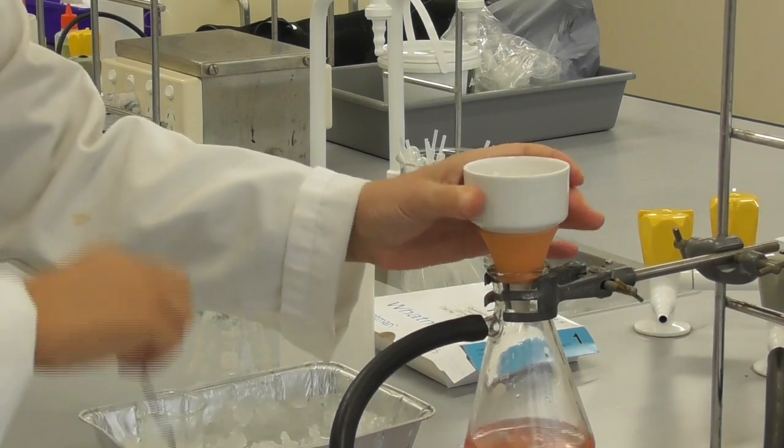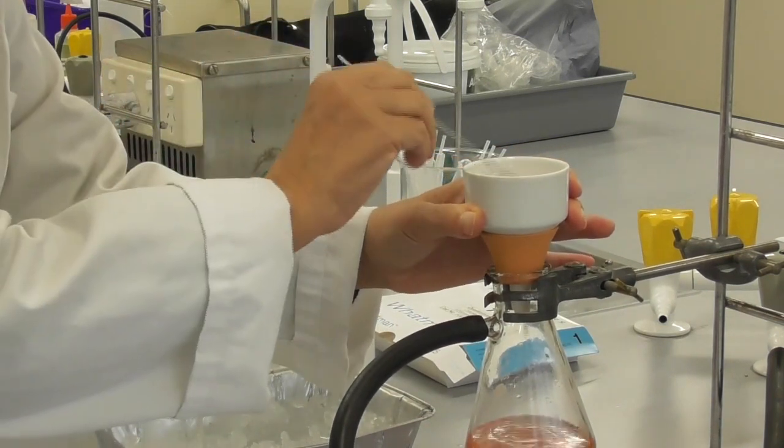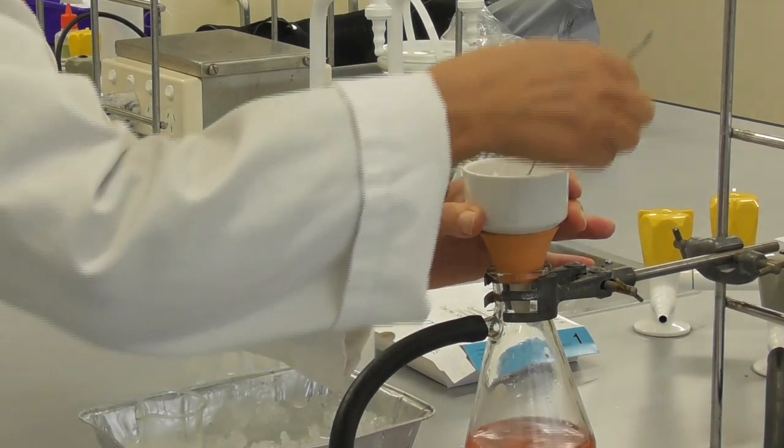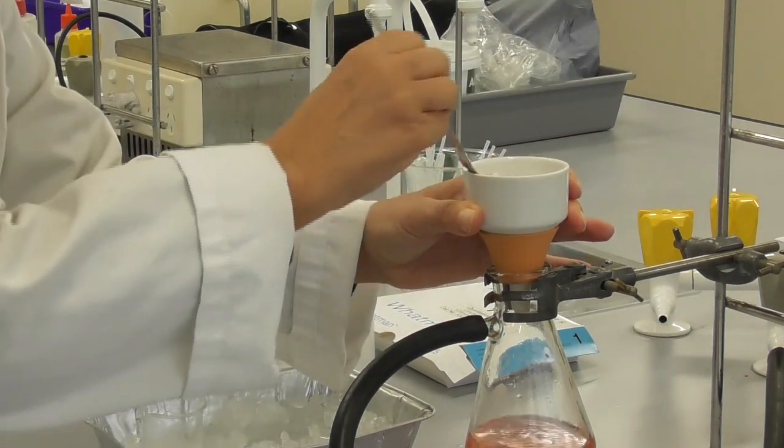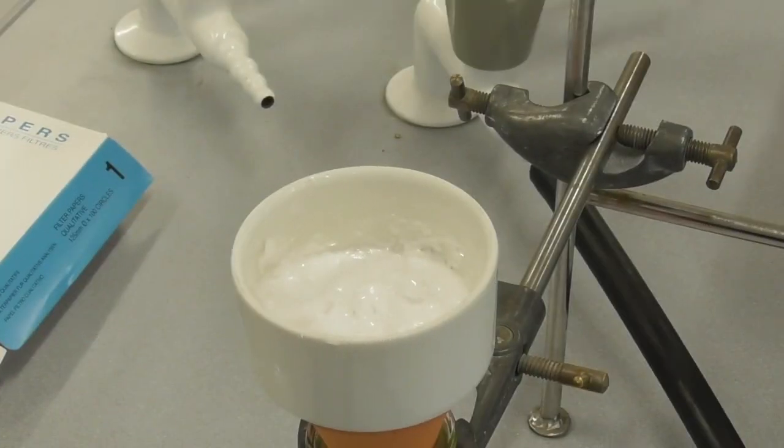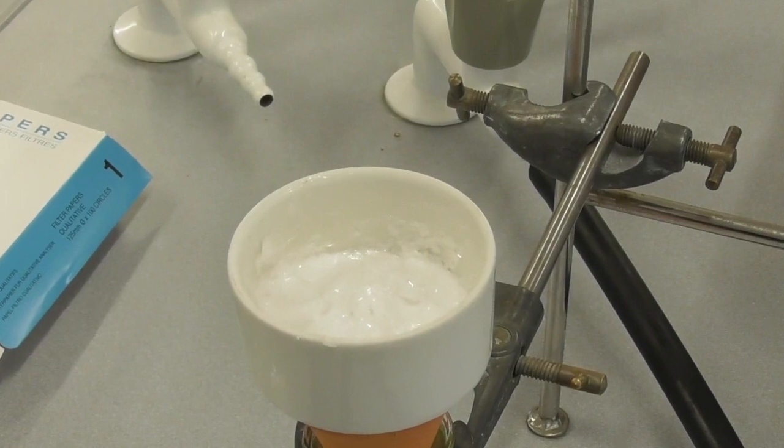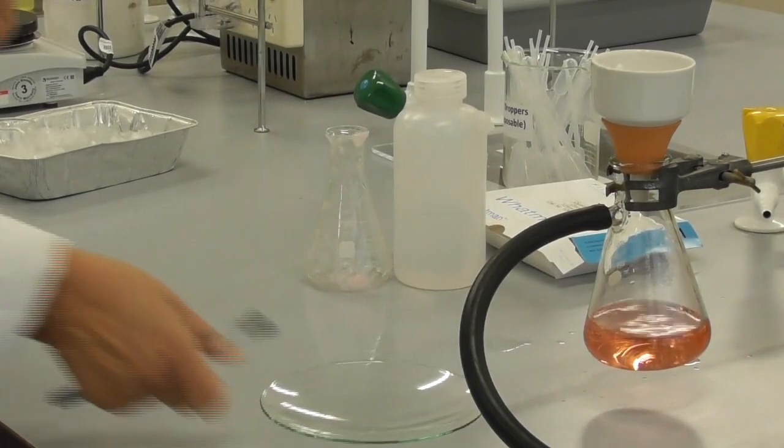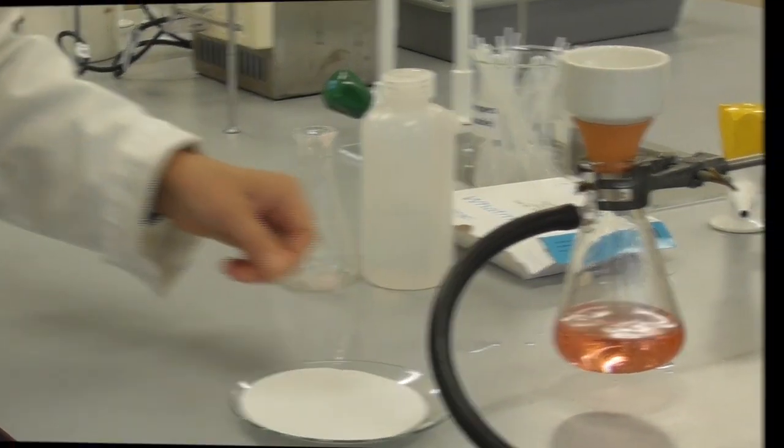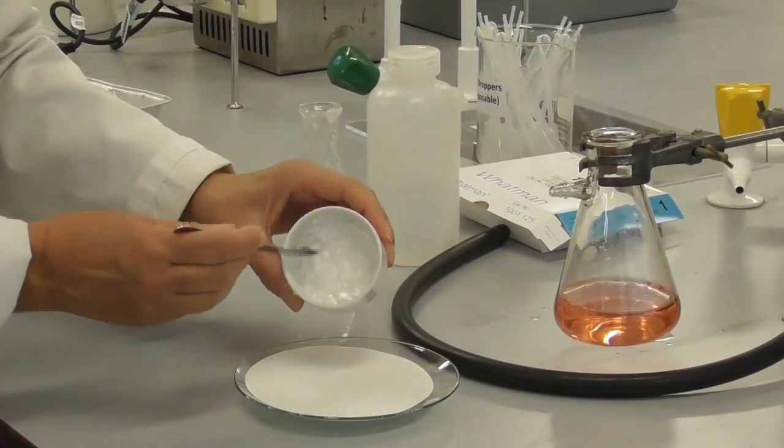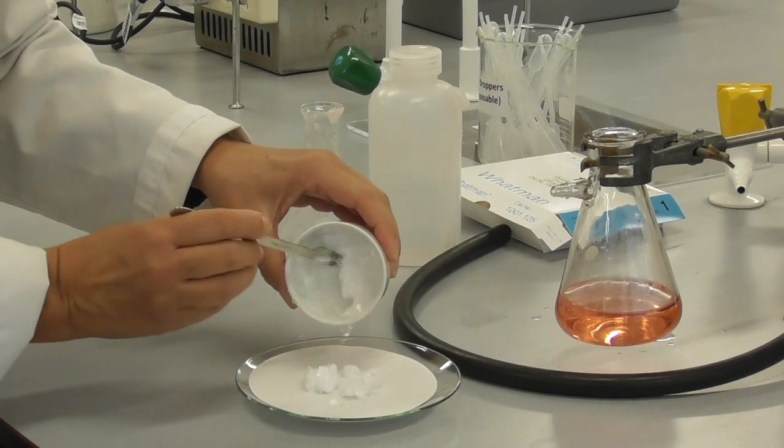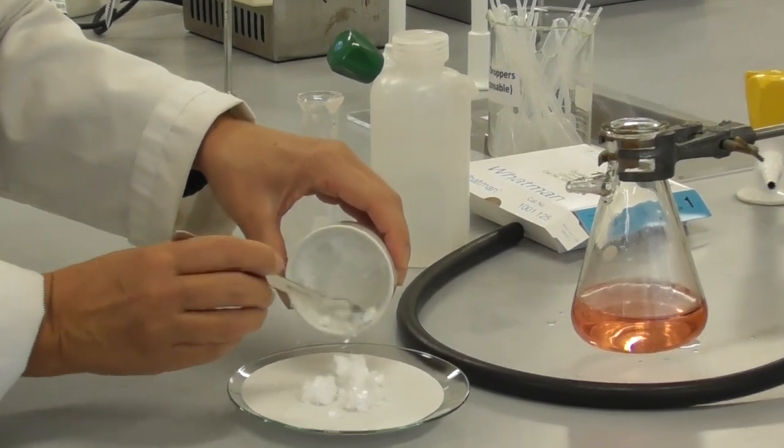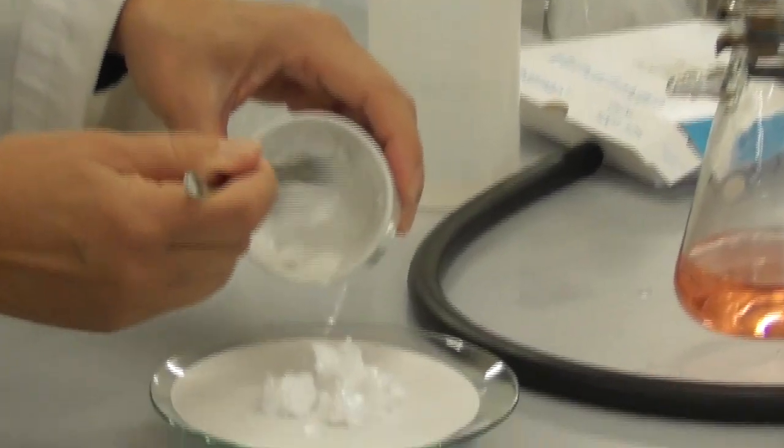We then re-apply the vacuum to suck the crystals dry and achieve fairly white, recrystallized benzoic acid this way. We get a watch glass and a large filter paper and then transfer the crystals from the buchner funnel onto the filter paper where we let them dry for a bit longer.